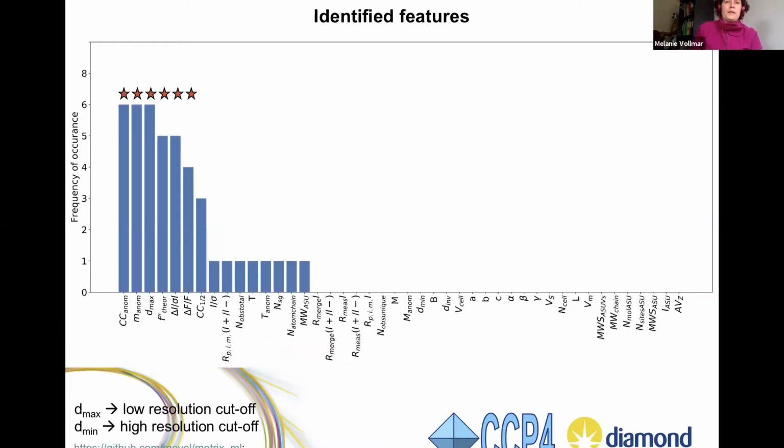So from all of the EDA and some initial trials, as I said, I found these six features up here. I've also explored adding the seventh one here or just used the first three, but none of these feature sets produced as stable a predictor as those six combined for this AdaBoost, a decision tree with AdaBoost. That was the most favorable predictor I found. All the other shallow learners I tried, whether an extreme random forest or just a simple decision tree, none of them proved to be as stable.